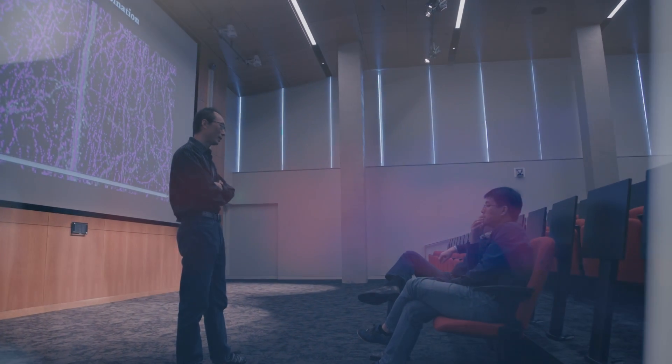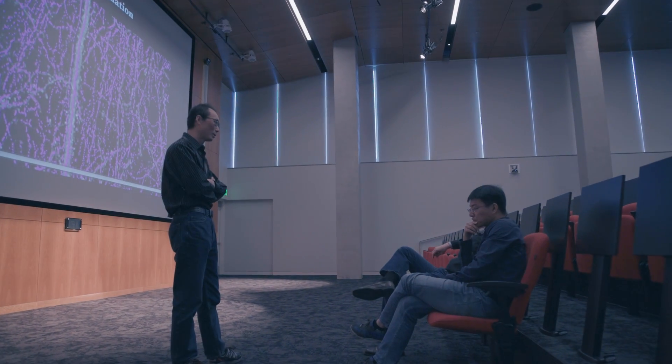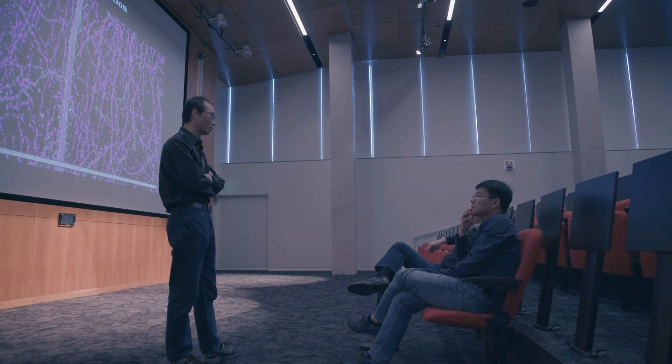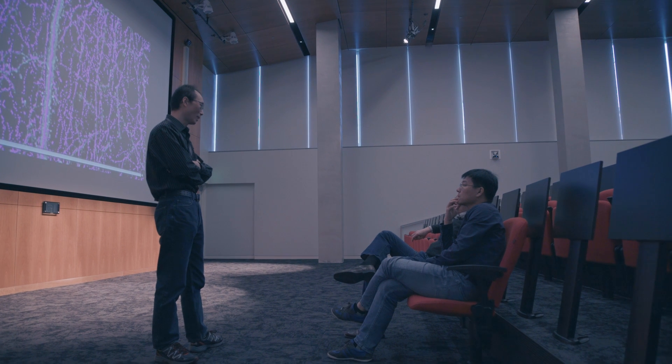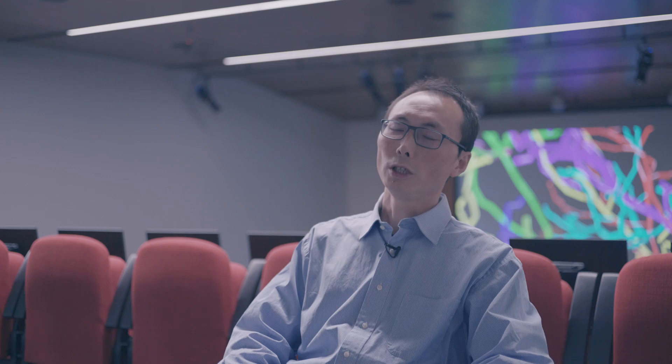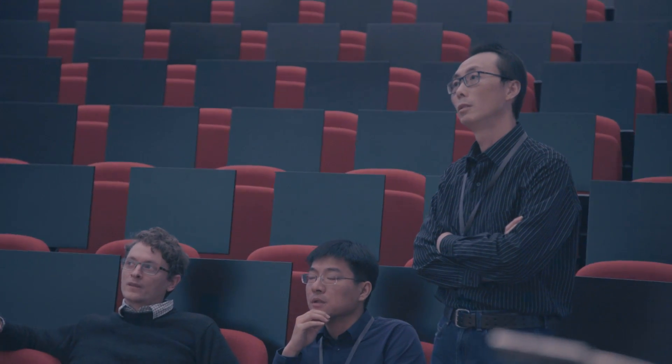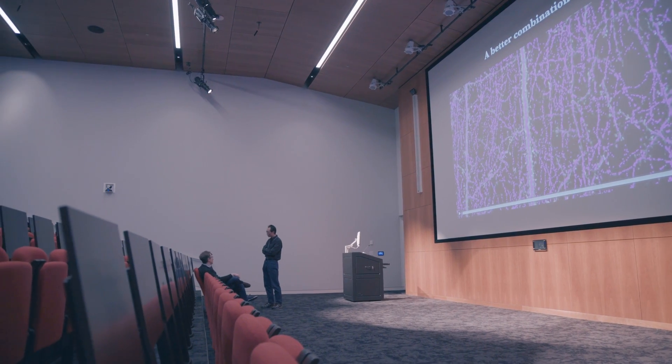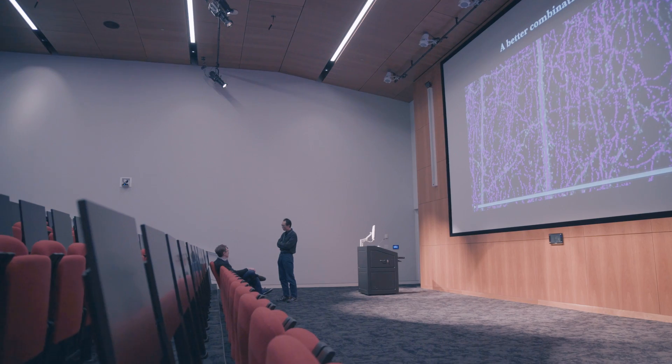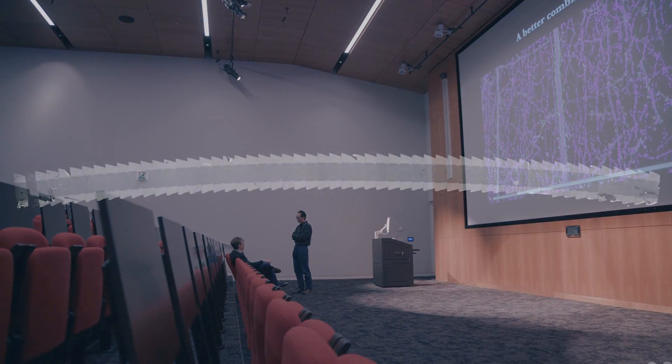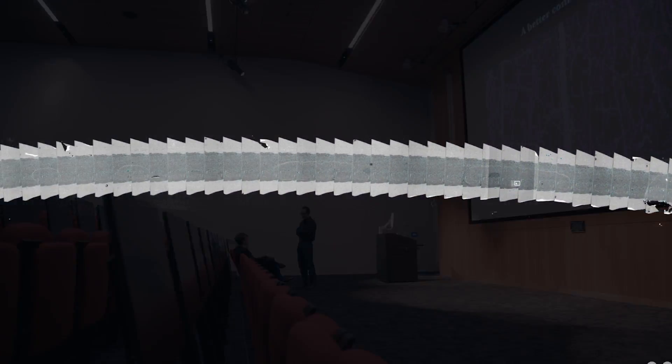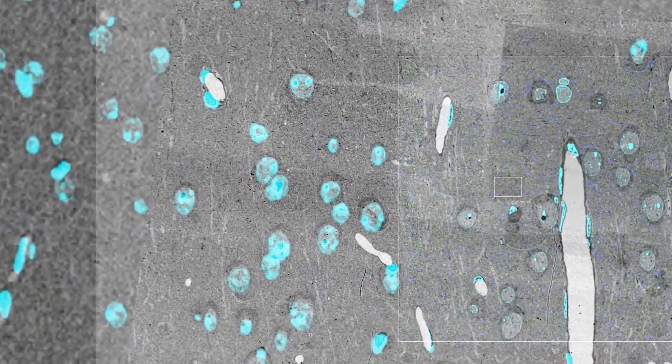The reason why we want to move to fully automatic reconstruction is really because of the scale of the problem. To really understand how many types of neurons are there as well as the connectivity map of these neurons, we need to have big sample numbers to accomplish such a task.